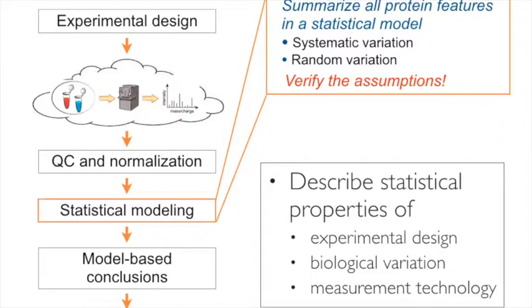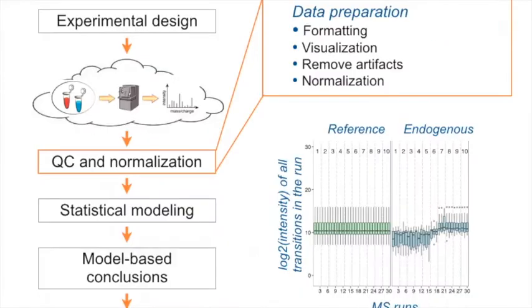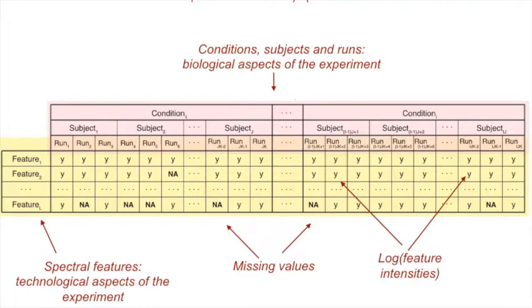Okay, so statistical modeling. This is now what happens once we actually read the data into MSstats, so log transform and normalize, right? The next thing is to actually represent all the complexity of the data. If I go back to this figure, for one protein we have multiple features, multiple conditions, multiple runs, and missing data, or somehow low confidence values. So how do we handle that?